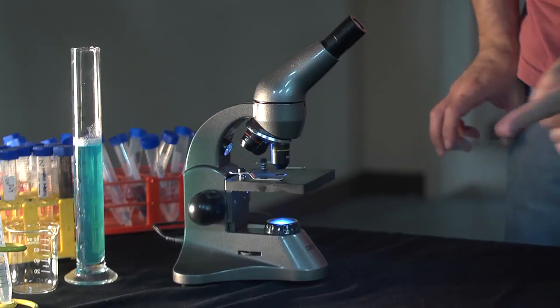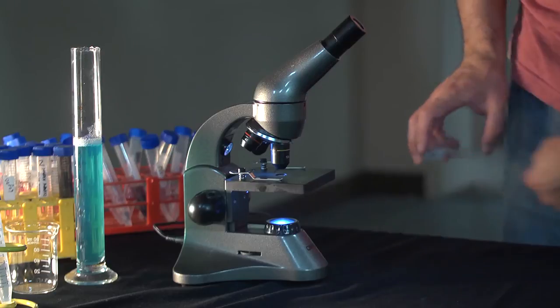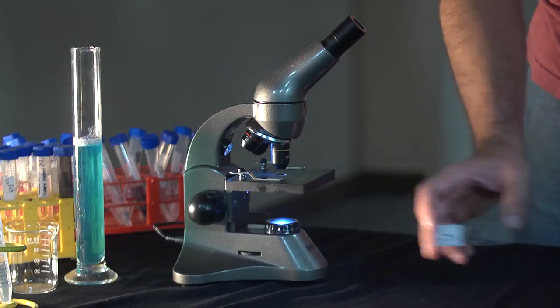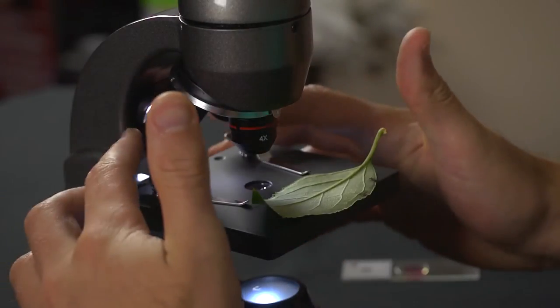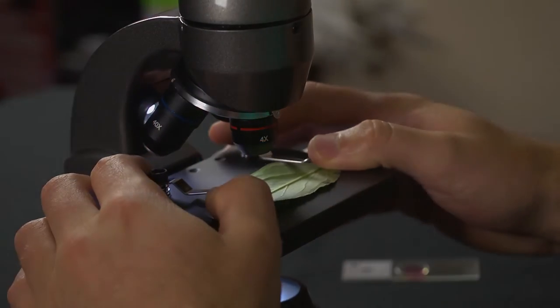Most biological microscopes only include a transmitted light source. That means they can only view transparent objects. On this model we've added a reflective light source so you can also look at semi-transparent or even opaque samples.